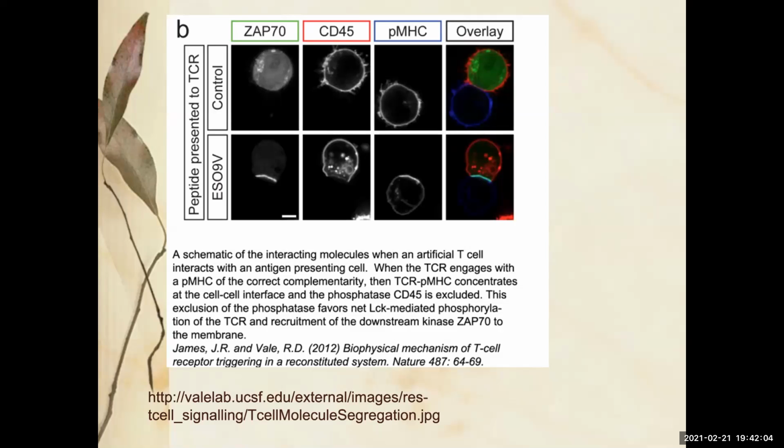Here's another image right below. So I was talking, if you're not seeing my mouse, I was talking about the top 4 squares or rectangles that are labeled as control images, right? And in this paper, they nicely call the fourth one overlays. So that's part of why I chose this. And then the bottom 4 images make up one image, because there's one set of info that's coming out of all 4 of those.